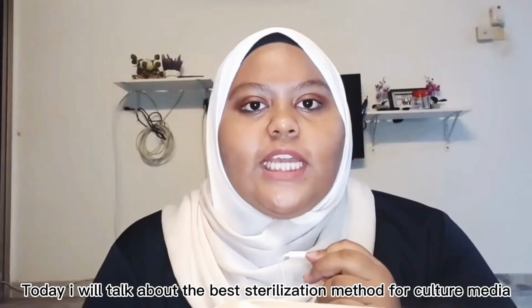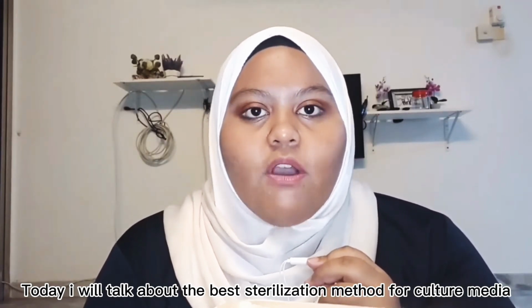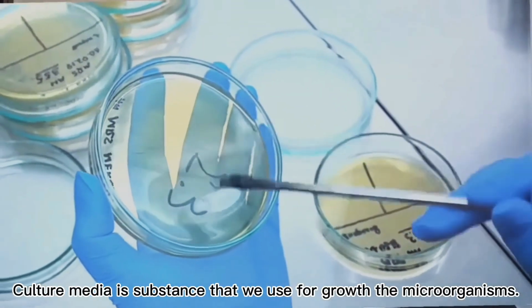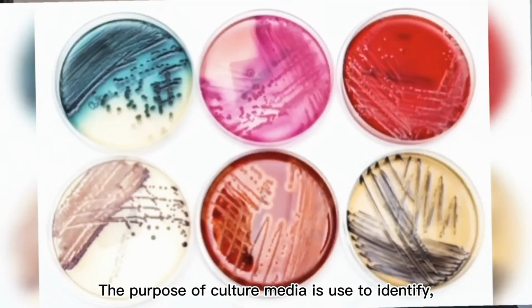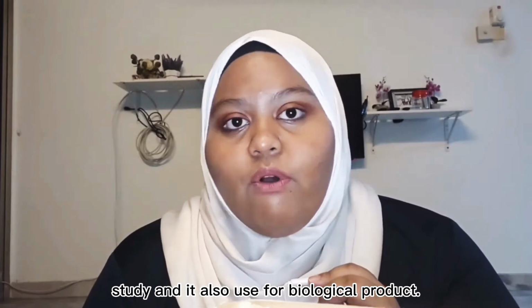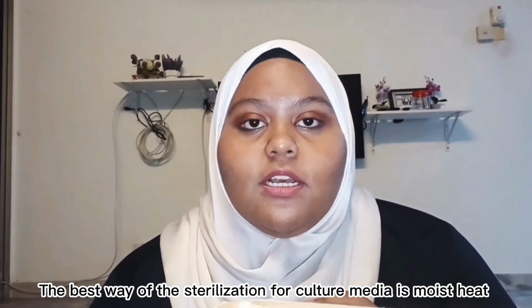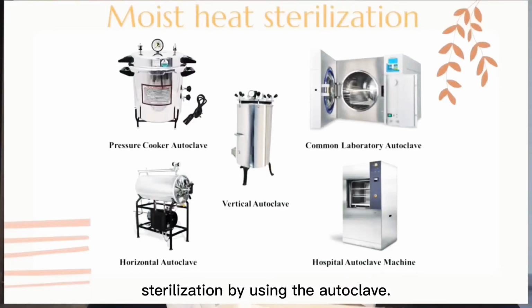PC09200056. Today I will talk about the best sterilization method for culture media. So what is culture media? Culture media is a substance that we use to grow microorganisms. The purpose of culture media is to identify, study, and it is also used for biological products. The best way of sterilization for culture media is moist heat sterilization by using the autoclave.